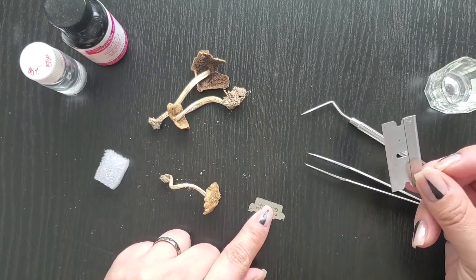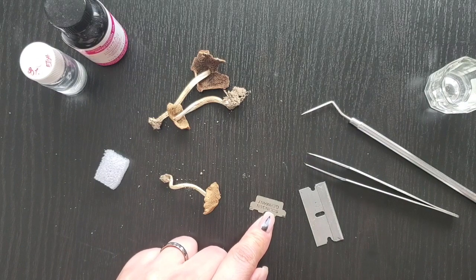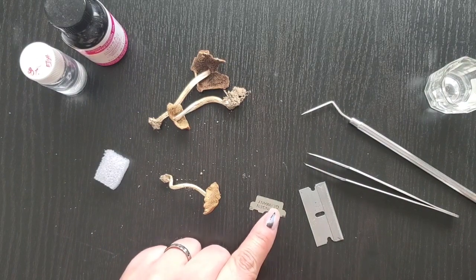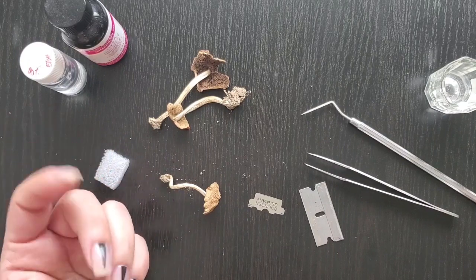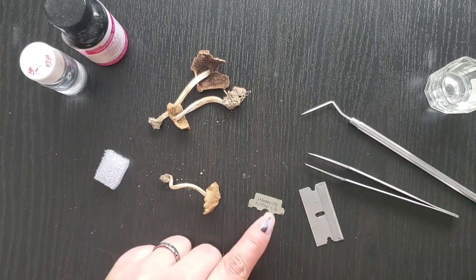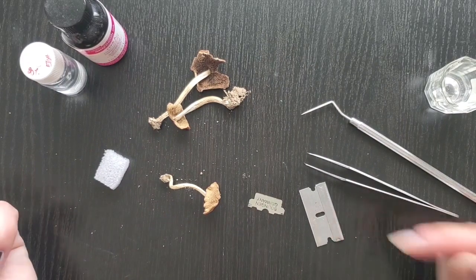And the best thing to actually get through your sections is going to be a much smaller blade. So if you haven't had successful sections, it may be the fact that your blade is just not thin enough. And these are regular blades. These are not microtome blades. These are just the kind that you find, I guess, in beauty salons. I guess they're for removing callus from people's feet. But basically, yes, these are absolutely ideal, even though these are more commonplace in stores.